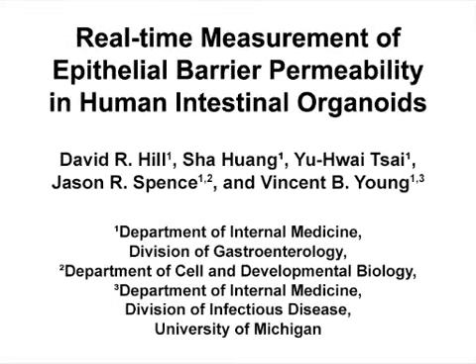The overall goal of this procedure is to measure epithelial barrier permeability in human intestinal organoids over time. This method can help answer key questions in the gastroenterology field, such as how specific toxins, bacterial products, or even pharmacologic treatments can alter epithelial barrier permeability.